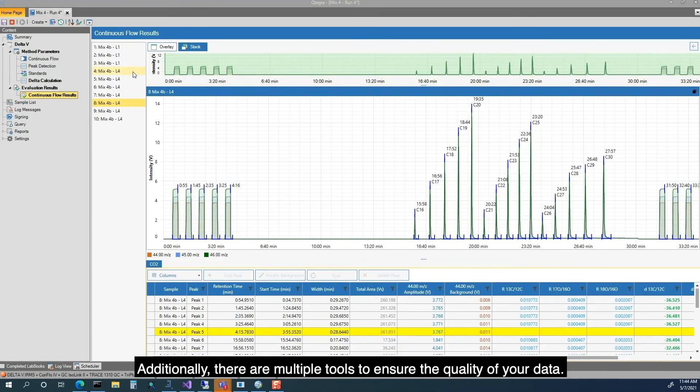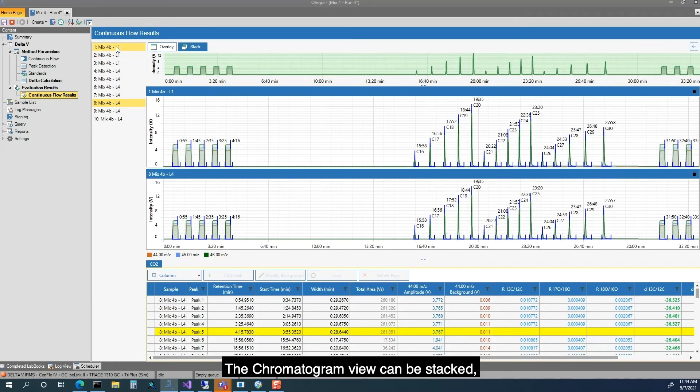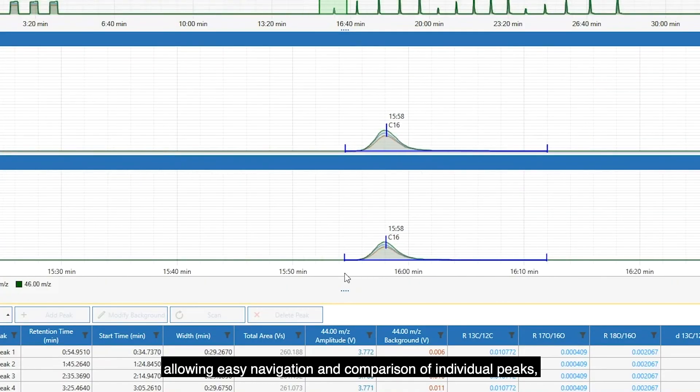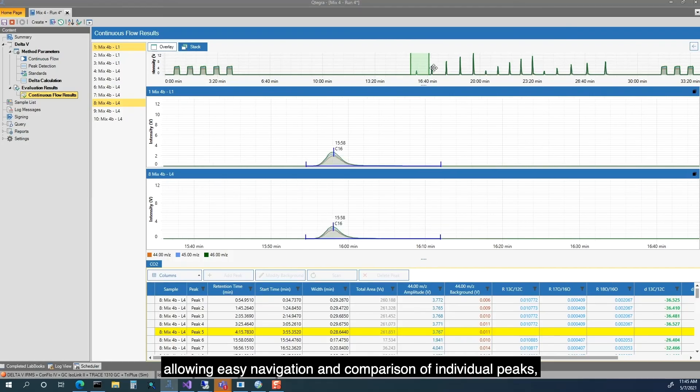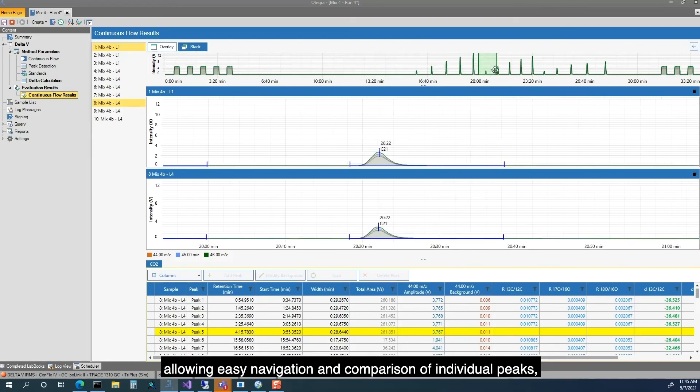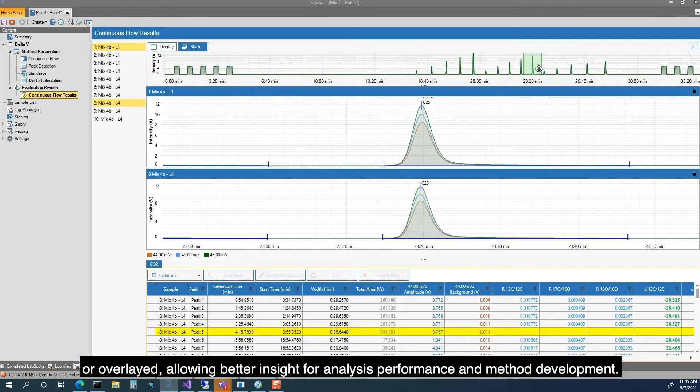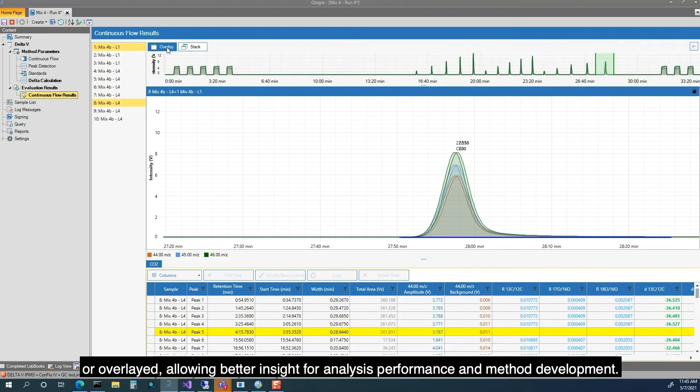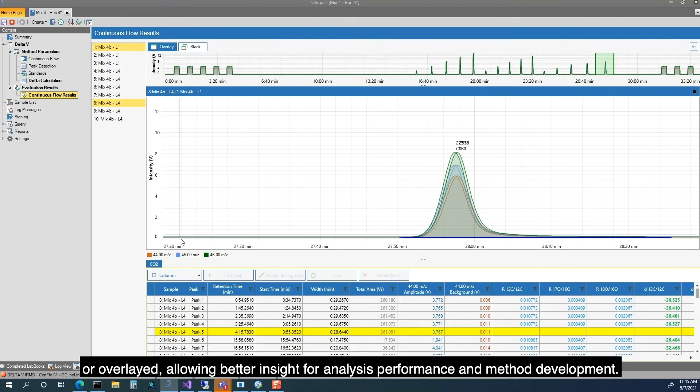Additionally, there are multiple tools to ensure the quality of your data. The Chromatogram view can be stacked, allowing easy navigation and comparison of individual peaks, or overlaid, allowing better insight for analysis performance and method development.